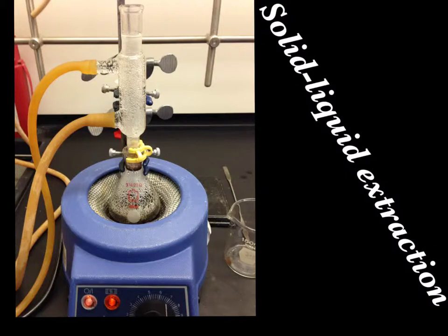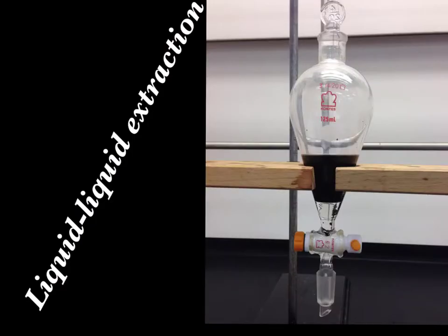A distillation flask and condenser were used for the solid liquid extraction. The leaves were heated in the sodium carbonate solution, which allowed the caffeine to dissolve in the aqueous layer. Once filtered from the leaves, the caffeine was extracted from the aqueous layer with dichloromethane.